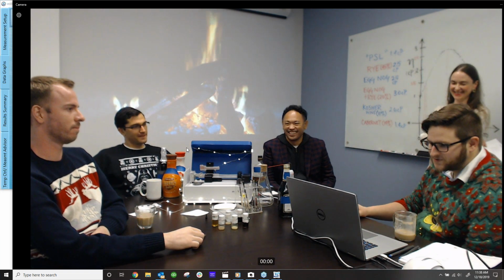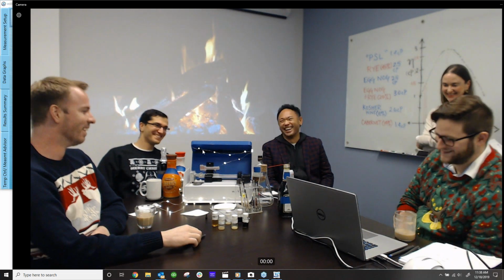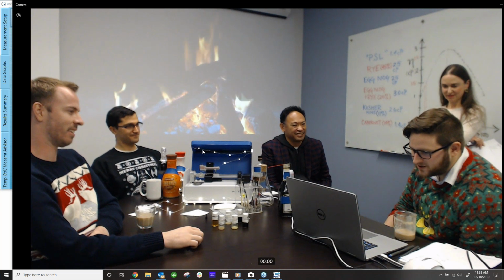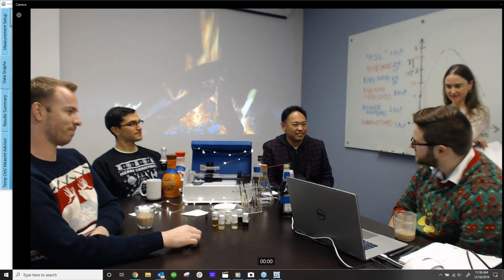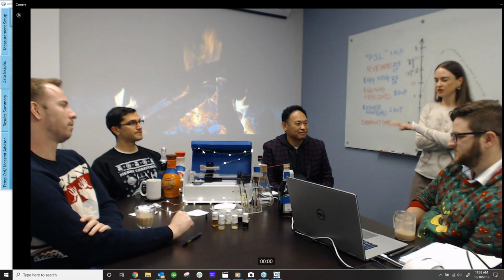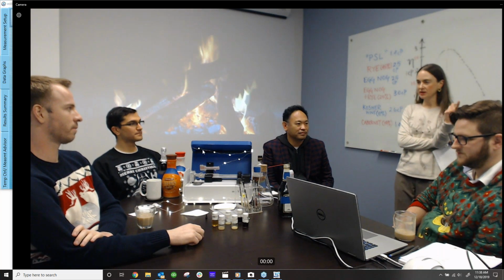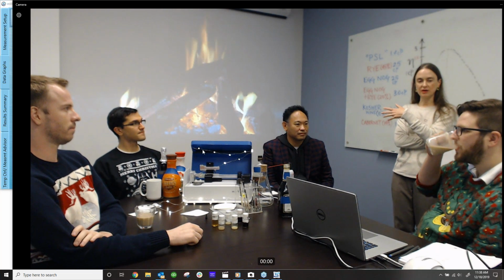Another question we have is, we had someone ask, can the machine handle thicker consumer products such as lotions, creams, shampoos? Yes, the answer is yes. As we hinted at a few moments ago when we were talking about the particle size and the viscosity range that we were testing, we do have a very broad range of pressures that we can access.